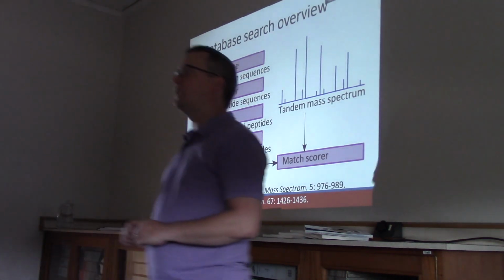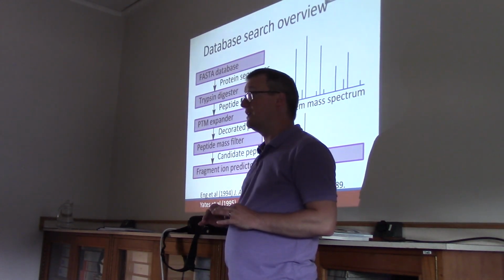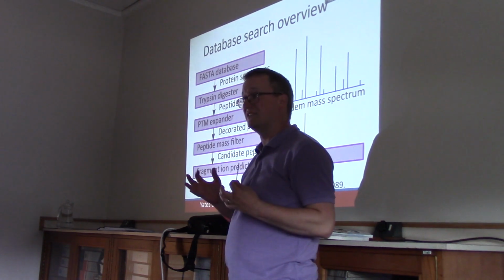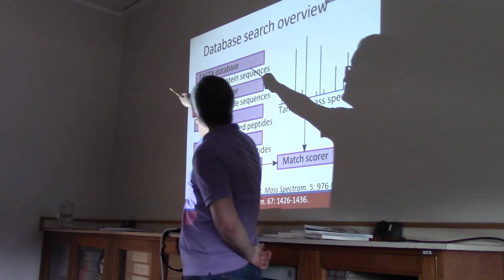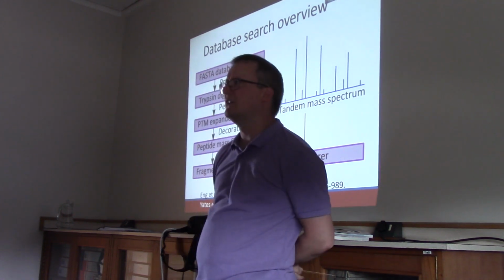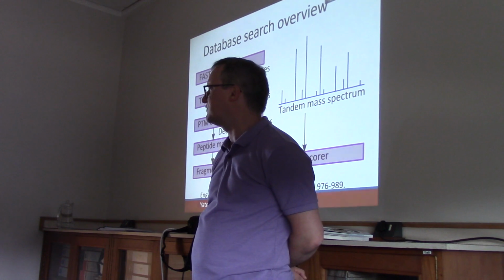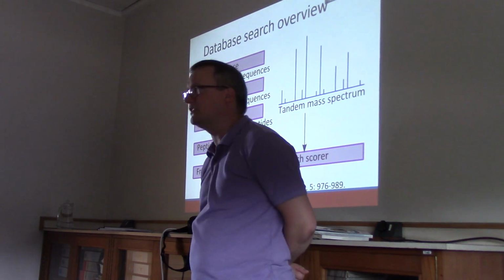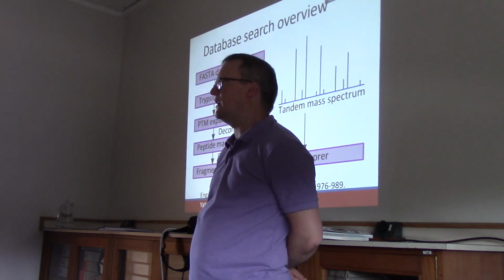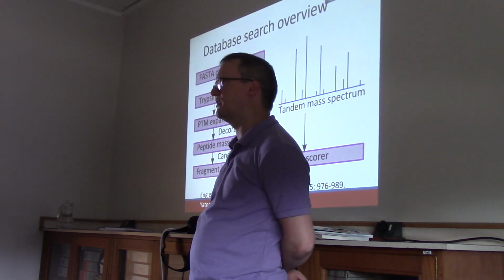All right, this block diagram is probably the most useful thing to take away from this lecture, because this shows all of the pieces that we include in our database search tools. We start with a sequence database. Now, we already talked about FASTA sequences in one of the earlier lectures this week. A FASTA sequence database is a list of protein sequences, or a list of nucleotide sequences, that each have some accession associated with them and some description associated with them.